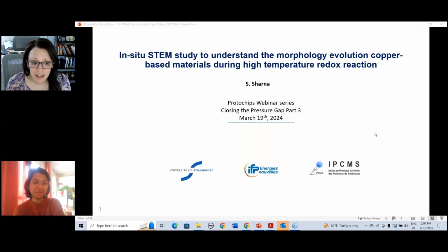Over the years, technologies evolved in an attempt to introduce gases into the vacuum chamber of the TEM safely, to watch these materials undergo these mechanisms, and under more realistic environments with the hopes of getting that direct insight in how their structure is affecting their function over time.